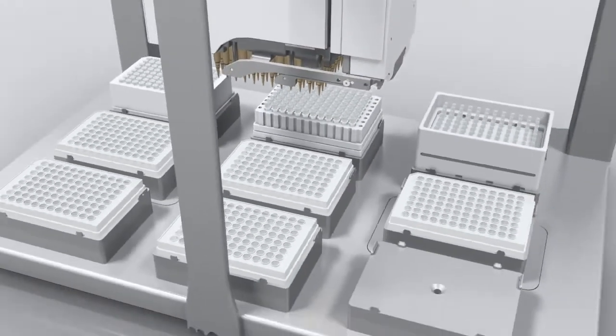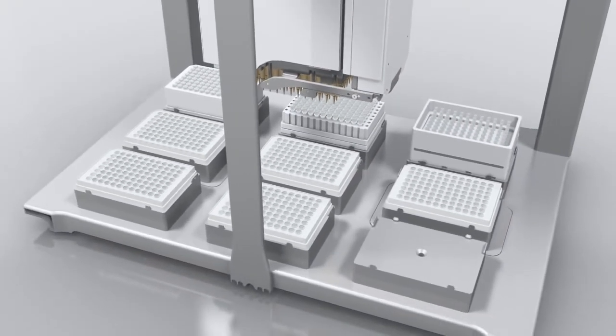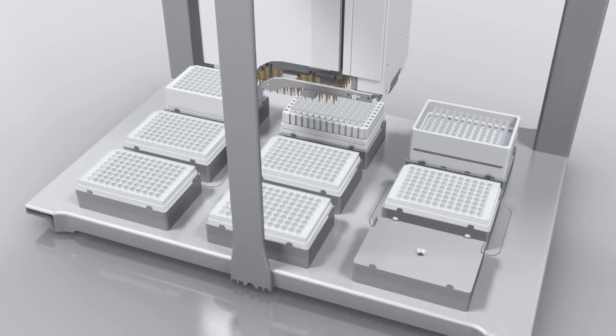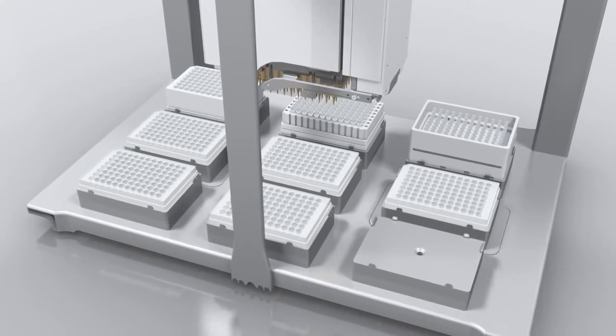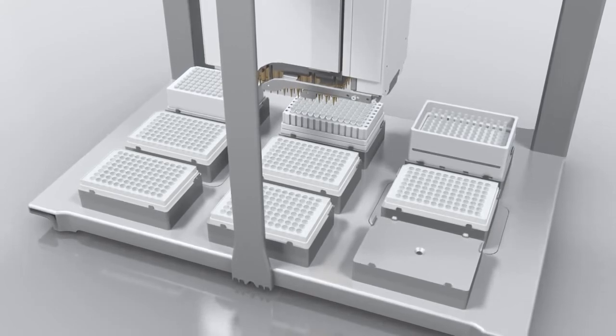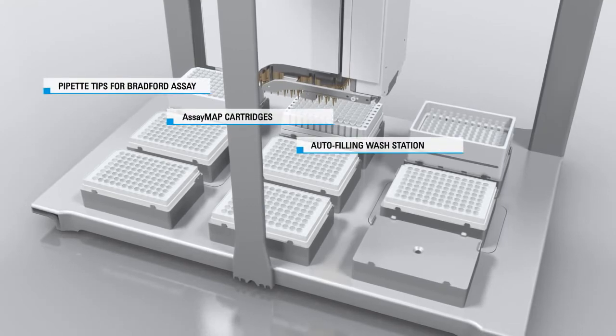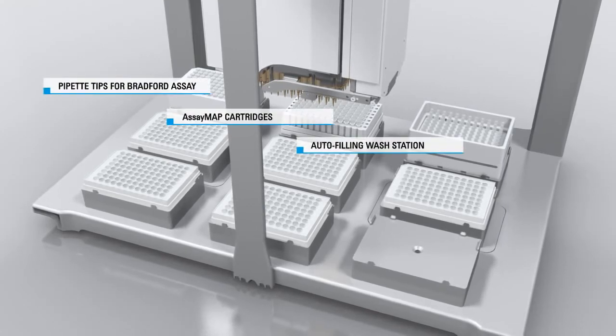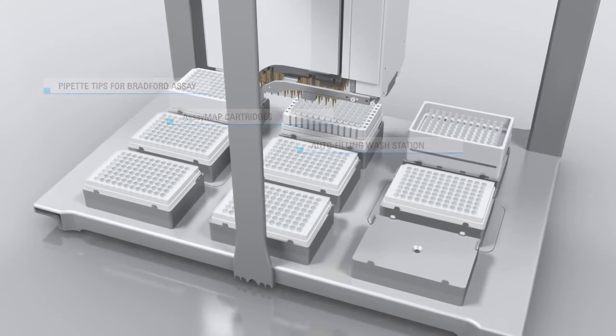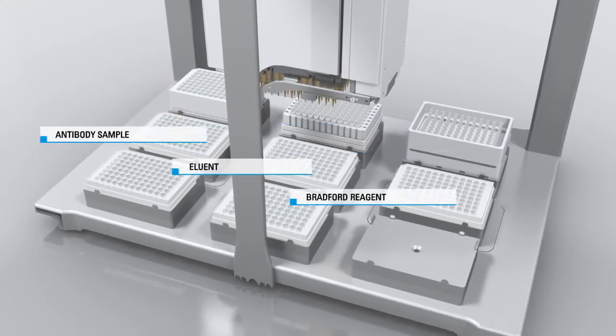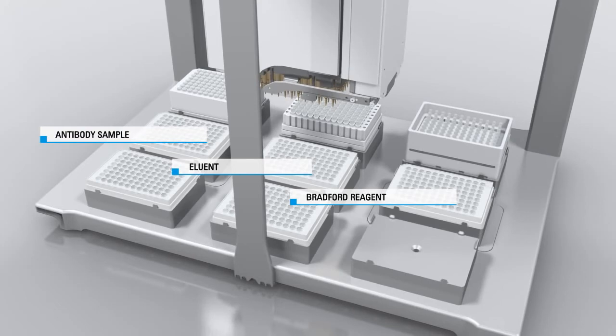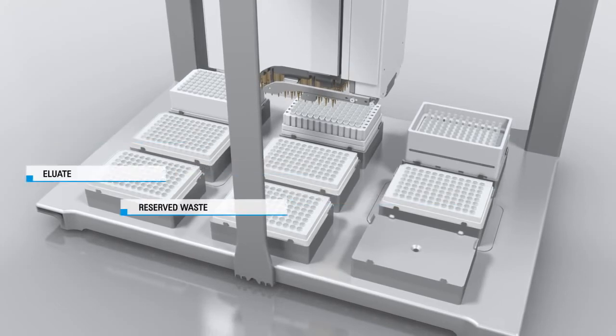In this example, you can see how the Bravo can be configured for a monoclonal antibody purification and titer assay using a protein A resin. The Bravo deck has positions for pipette tips for a Bradford assay, the AssayMap cartridges, an auto-filling wash station for cartridge wash steps, positions for the antibody sample, eluent and Bradford reagent, and empty collection plates for the eluent and wash flow-through waste in the front.